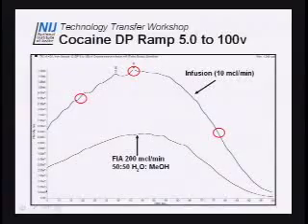You're actually using something very similar to this to produce fragmentation for you to analyze whatever's coming through the source. So you can see from here, this gave me great sensitivity for cocaine with just a little itty bit of fragmentation. And by here, I'm costing myself sensitivity for cocaine, right? And not only is the hubcap flown off, I've lost 2 wheels and all the watermelons.